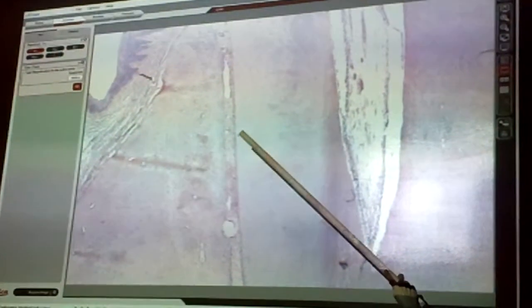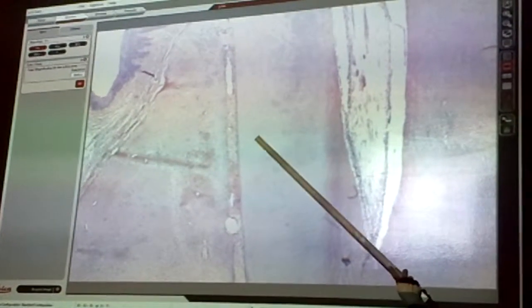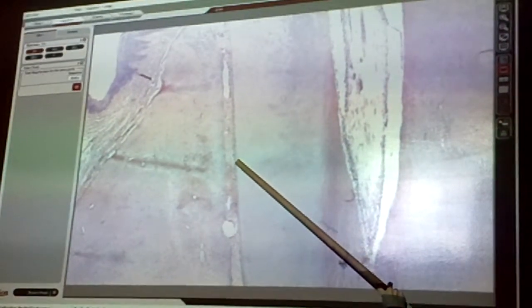This is the pulp cavity, center of the tooth, pulp cavity. All of this in here is dentin. All of it, dentin. And then we get to a few little layers on the edge here. So let me move this down just a second. Okay, so here's the bone, right? Everybody see the bone? Yes. In order to stick the tooth to the bone, we need a ligament. Well, that's this right here. And then the very edge of the tooth, goodness. So this is dentin. At the very edge there's a slight difference, that's the cementum.